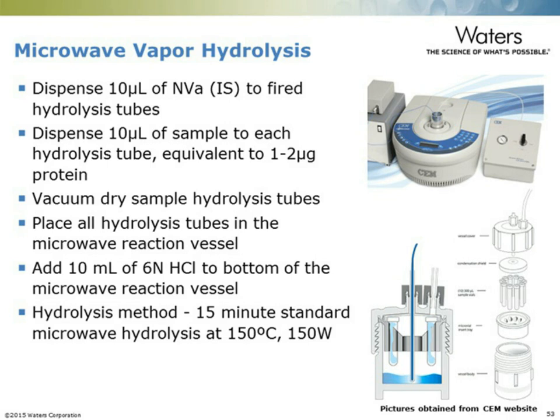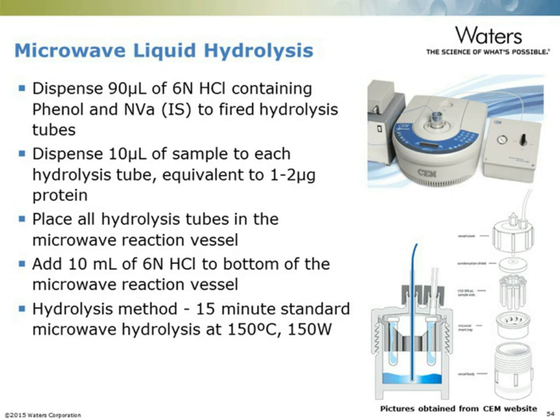In this case, instead of doing the hydrolysis overnight, we can do the hydrolysis in something on the order of 15 minutes, so that now the rate of hydrolysis is more compatible, more similar to the rate of the analytical method. We also use this device in a liquid phase where we put the acid directly into the vial, just as we did in the liquid phase hydrolysis reaction vessel.